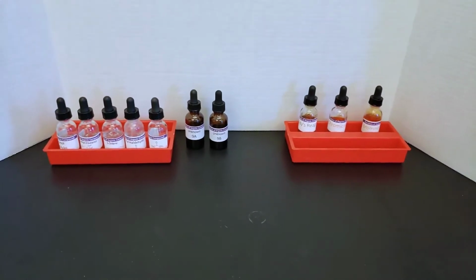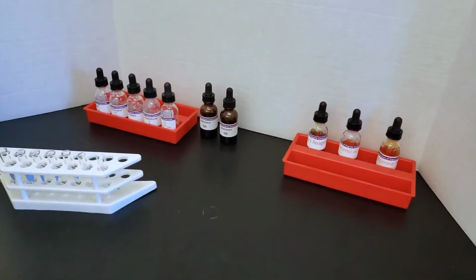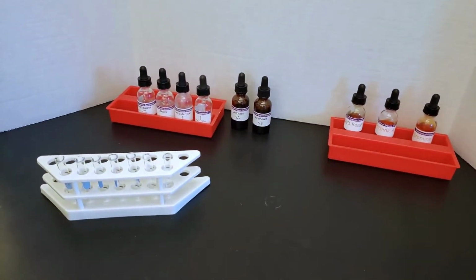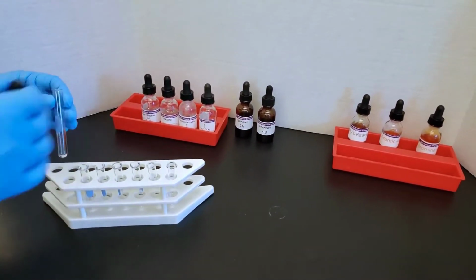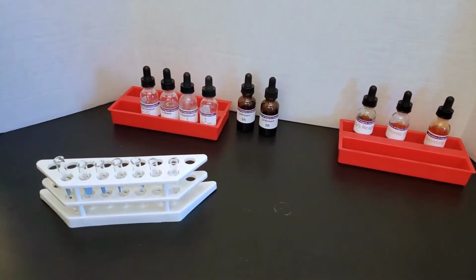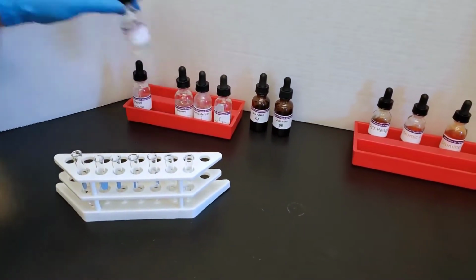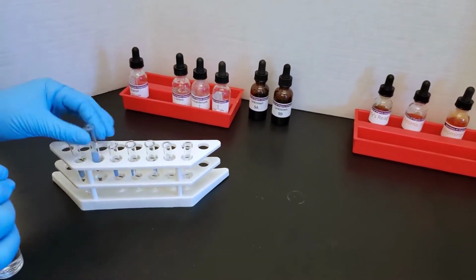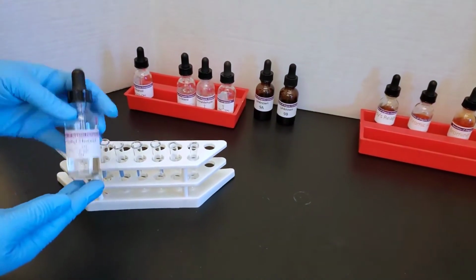Today we're going to take a few samples of organic chemicals and react them with some reagents that allow us to tell what the functional groups are. We're also going to look at two unknown compounds and see if we can identify them. The unknowns are going to be one of these first five that we're testing.